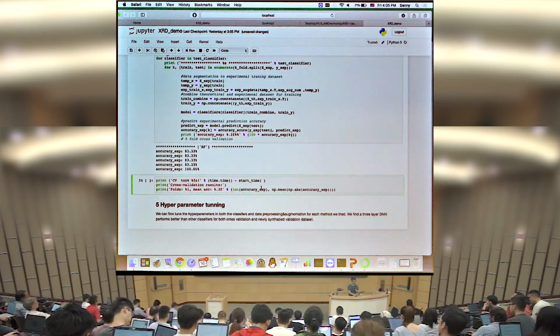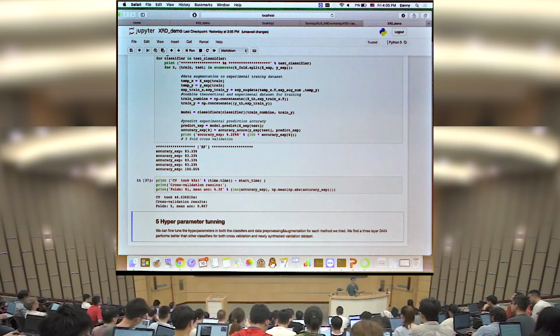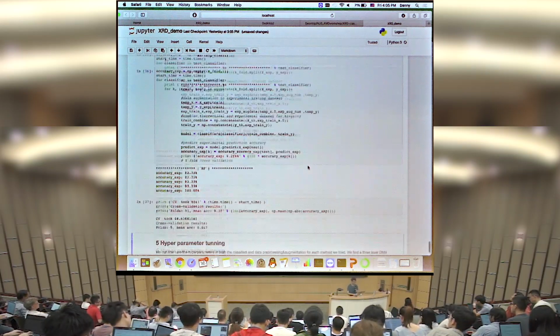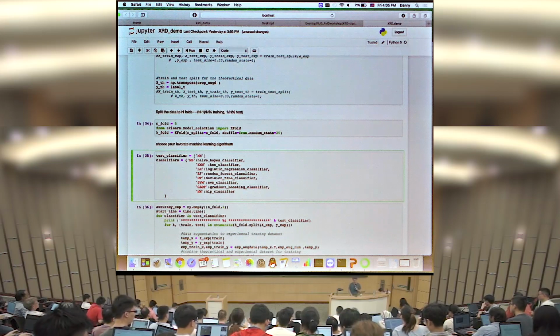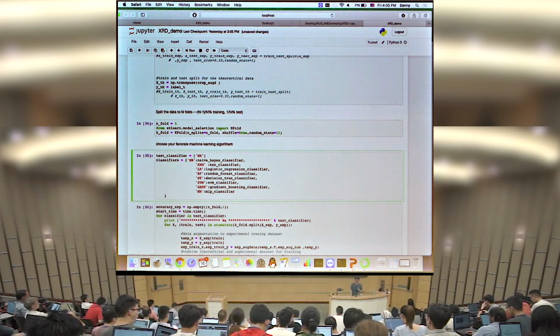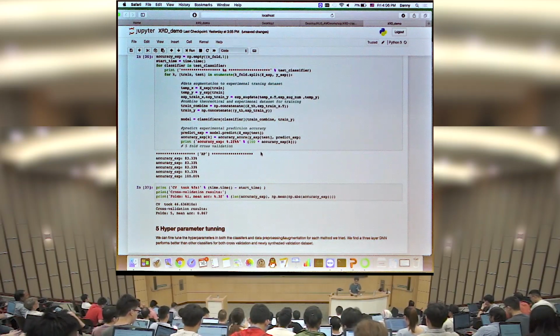So what we can do is we can take an average of this value. If we do the cross-validation with 5 folds, the mean accuracy is 86.7%. So that's just with the random forest classifier. You can also try this with a neural network. For our study, we actually use a 3-layer neural network with 256 neurons. It is a dense neural network, and the activation function is a ReLU function.